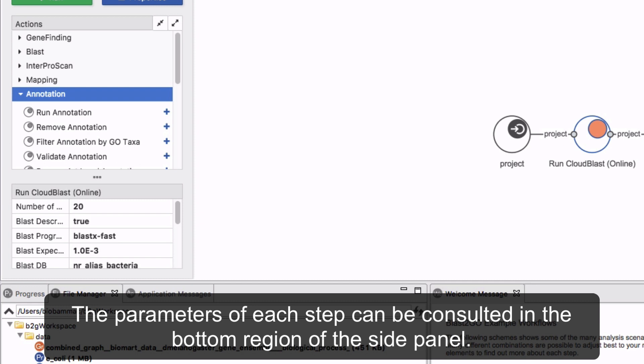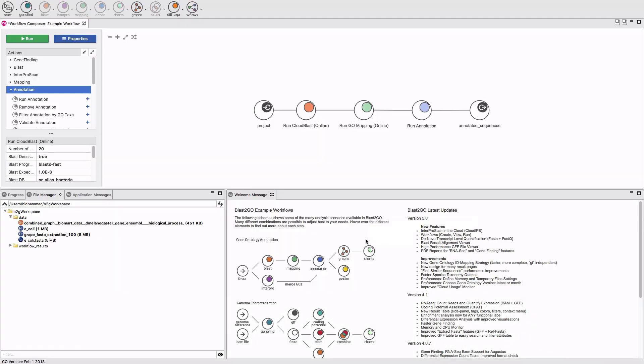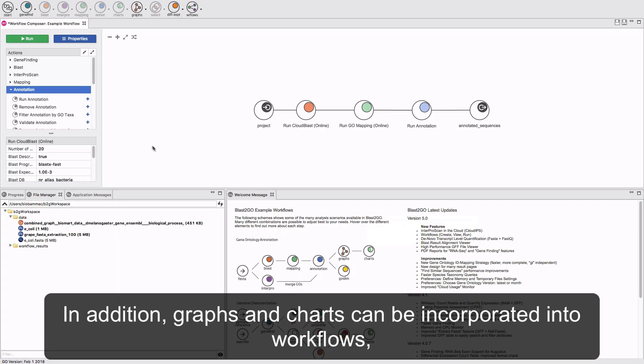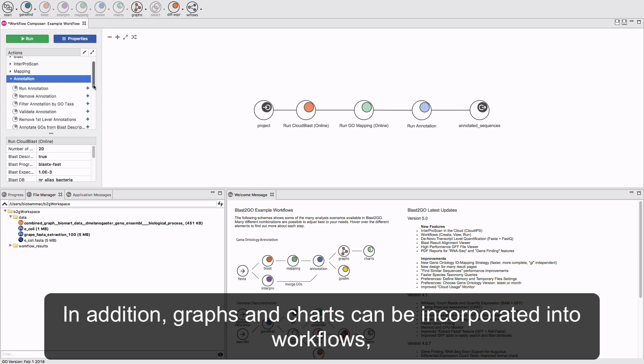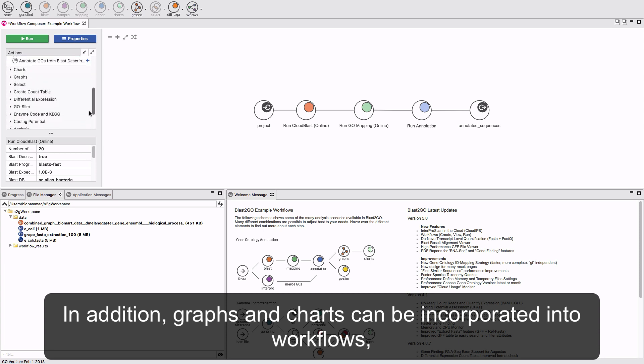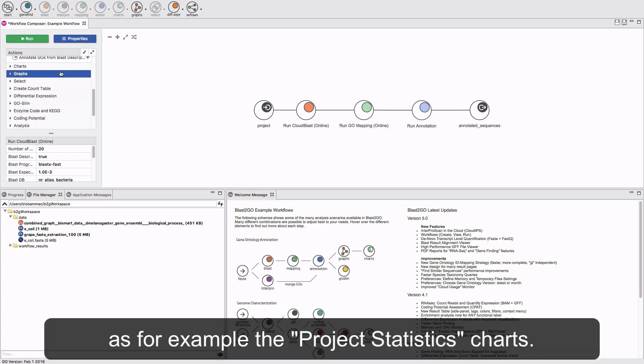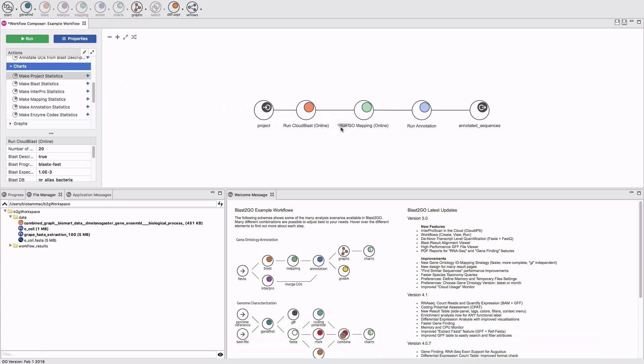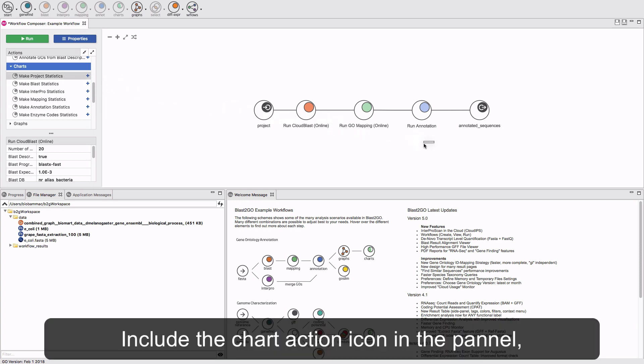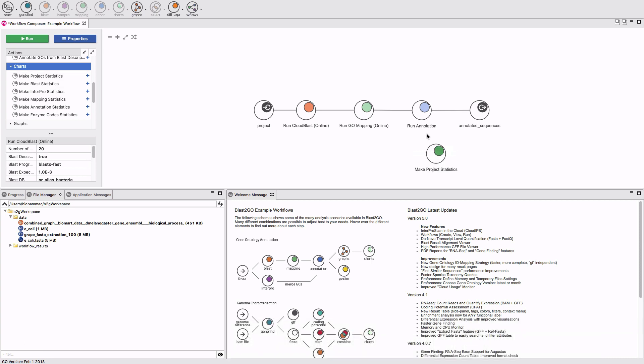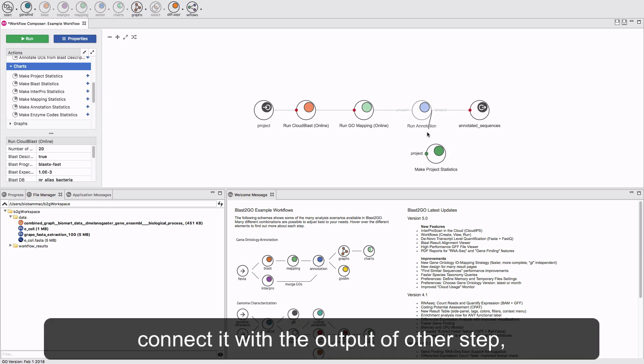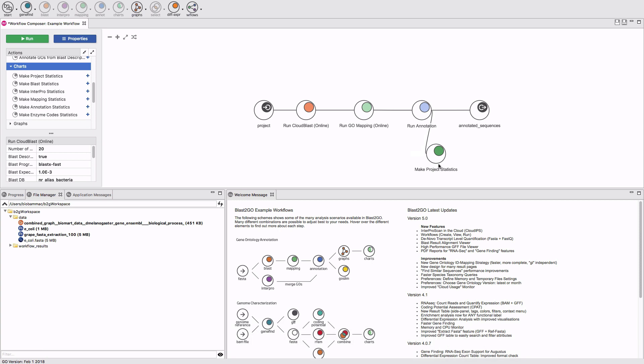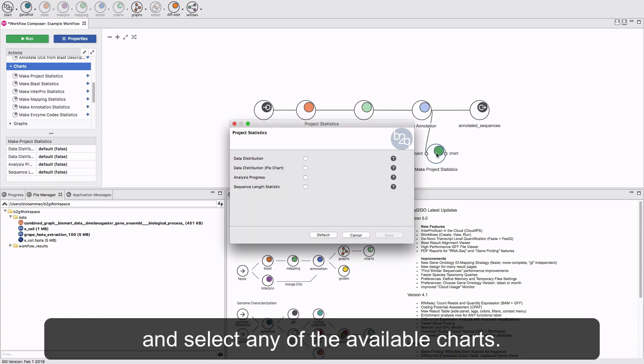The parameters of each step can be consulted in the bottom region of the side panel. In addition, graphs and charts can be incorporated into the workflows. For example, the Project Statistics Charts. Include the Chart Action icon in the panel, connect it with the output of another step, and select any of the available charts.